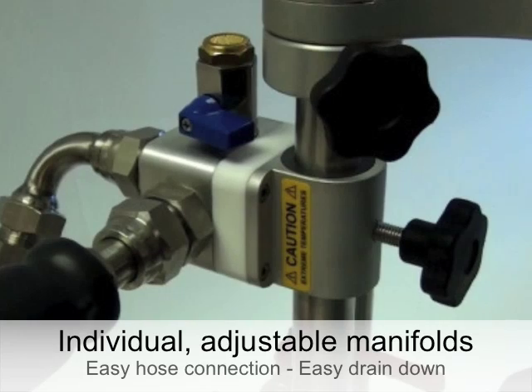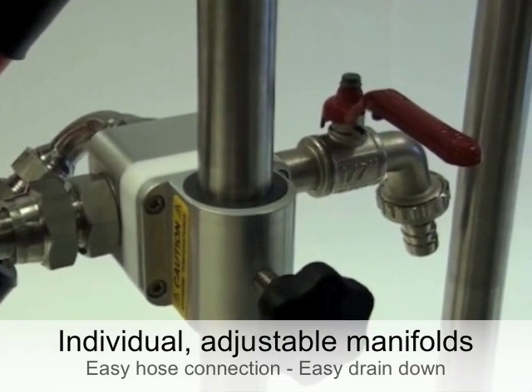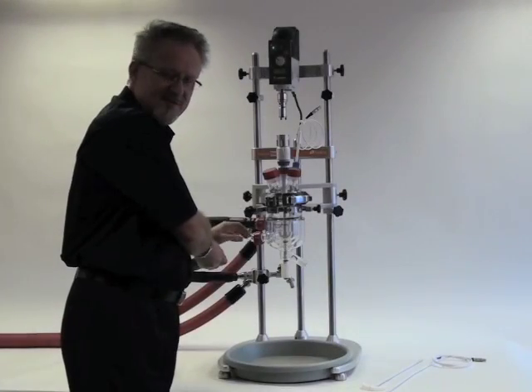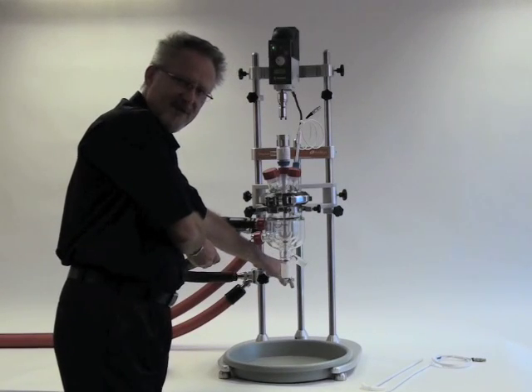As you can see here, the upper manifold has a vent and the lower manifold has a drain stopcock. The heat transfer fluid can either be drained back to the circulator or separately by this drain.